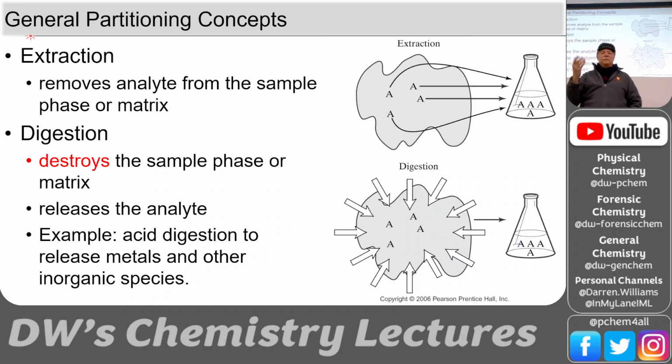So acid digestion with microwave assist is a really aggressive digestion technique. And also you're heating something in a container that's going to build up pressure. And so these are special microwaves. Don't be using a household microwave for this. The doors are locked in there so they don't blow open if this thing blows up for whatever reason.